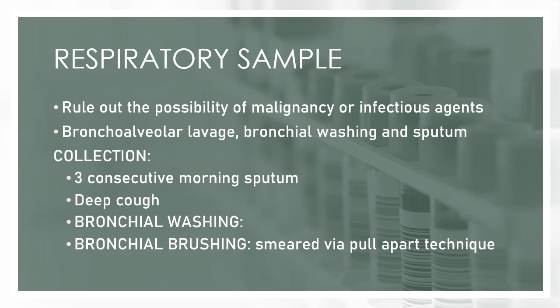Then, of course, you have your bronchial washing and your bronchial brushing, and your lavage. For bronchial washing and bronchial brushing, the smear is prepared via the pull apart technique. Again, for these you use your bronchoscopy.